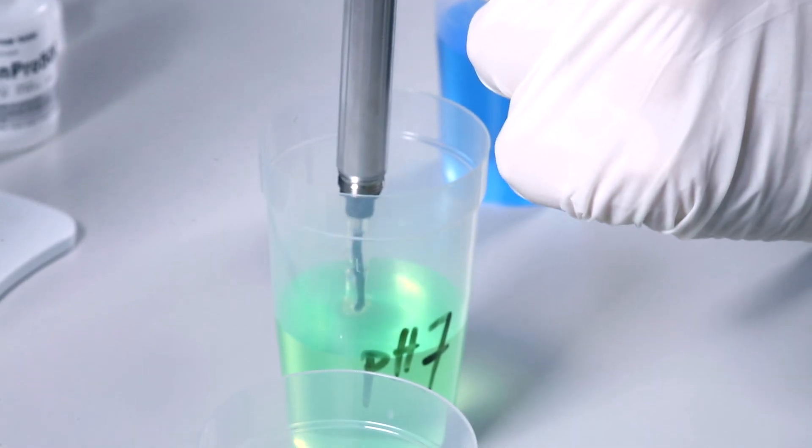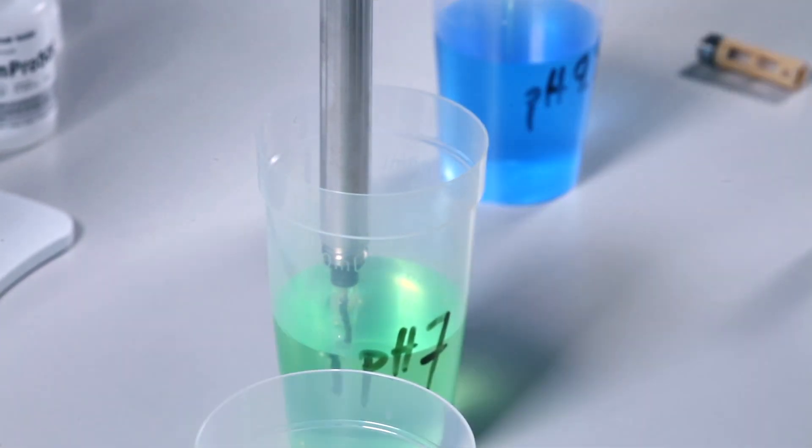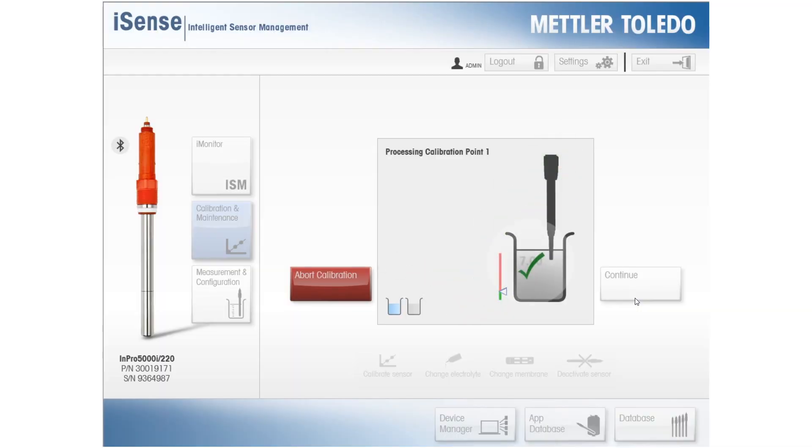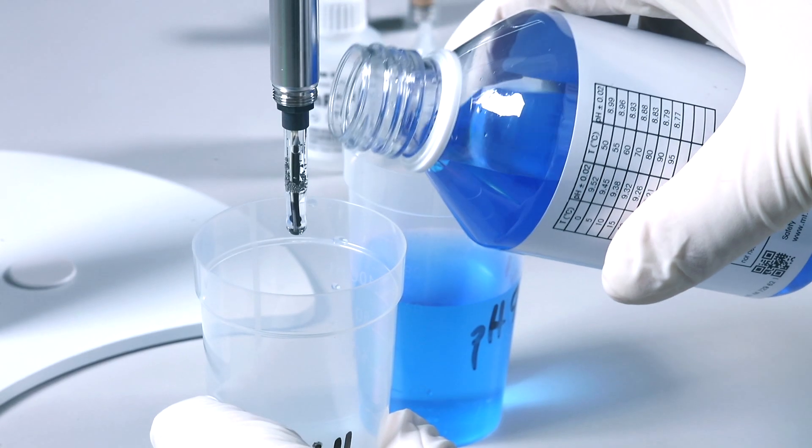Immerse the pH probe in the first buffer. Be careful not to touch the retainer nut during the procedure. iSense conveniently shows the whole calibration process in animated steps. After following all the steps, iSense shows you the calibration results.